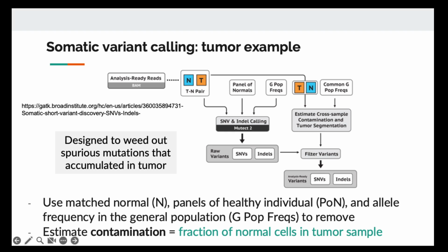So the variant calling pipeline for somatic mutation includes not only the mutation discovery part, but also how to filter out uninteresting mutations, basically. They want to make it so that your final result is as compact as possible. Otherwise, you're going to get a million rows of variants, and you cannot do anything because there are just too many of them.